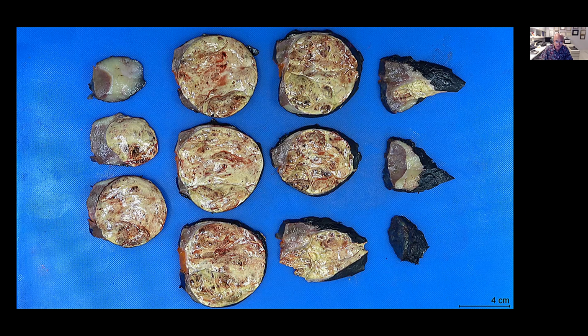But the most important documentation is going to be in the cross sections of the specimen, from end to end, as you can see here, where we can see even the renal parenchyma that was well sampled, with very good delineation of the borders, that can give us an idea that that tumor is well circumscribed.